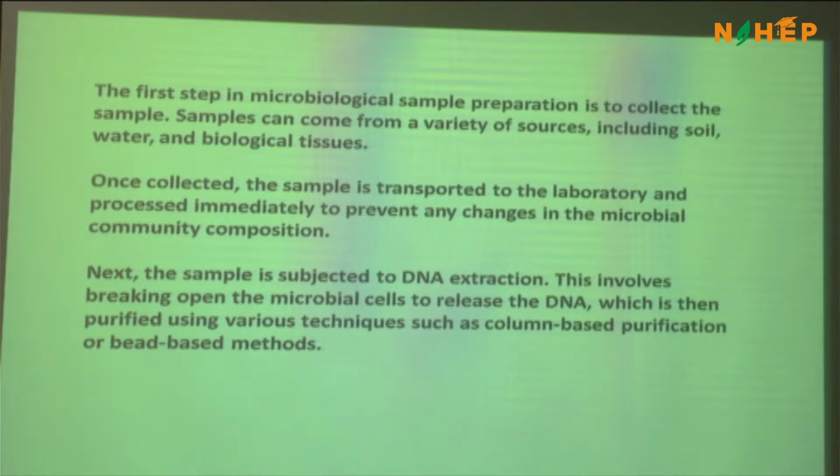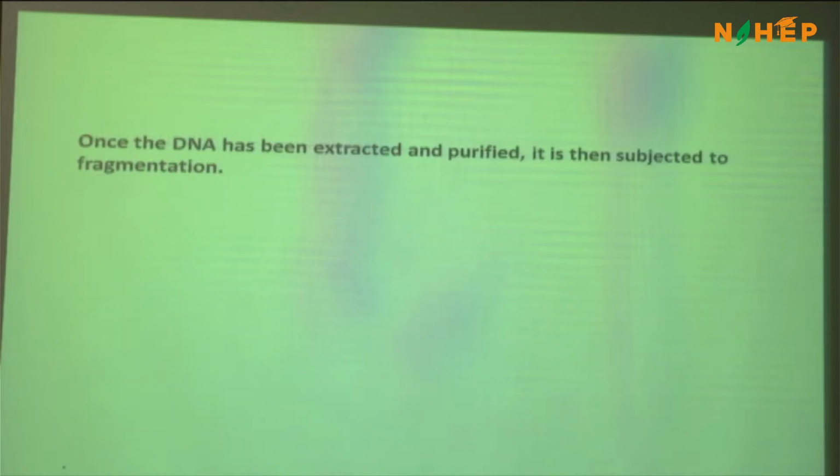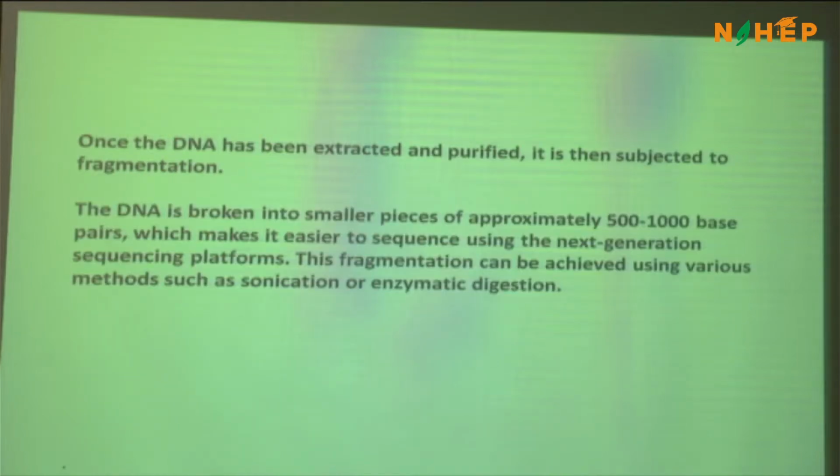And the two DNAs, coming from the same sample, go through polymerase chain reaction. Amplicons are generated, and the amplicons are mixed at the end of the experiment. That goes for sequencing, right? Because that is the workflow we adopt in our lab. And of course, DNA isolation has its own issues, like it should be high molecular weight and highly pure DNA. I think the NEO team has already conveyed to you what should be done. Okay, I'll skip this DNA isolation.